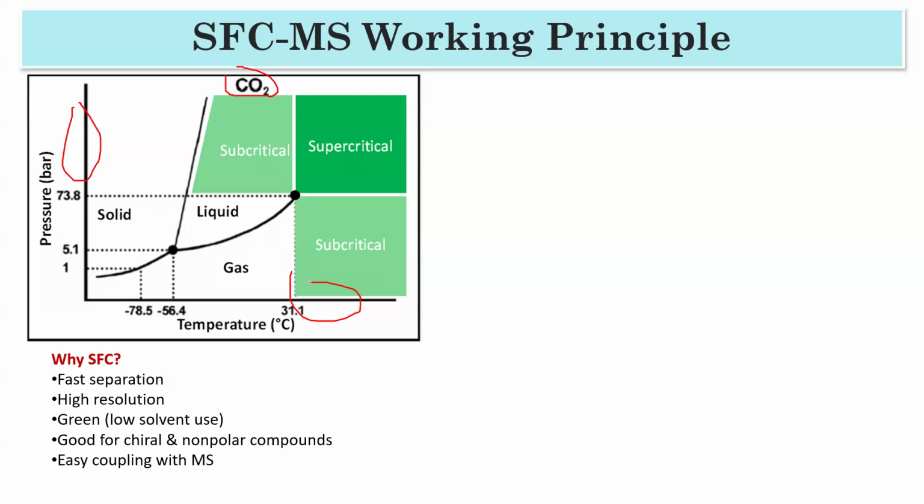it's not good, right? Because you know that CO2 is just a gas at room temperature. So at room temperature, if we want to use CO2, it has to be pressurized. You can use it, it is safe, but if you want to do it at large scale, it is not so good.